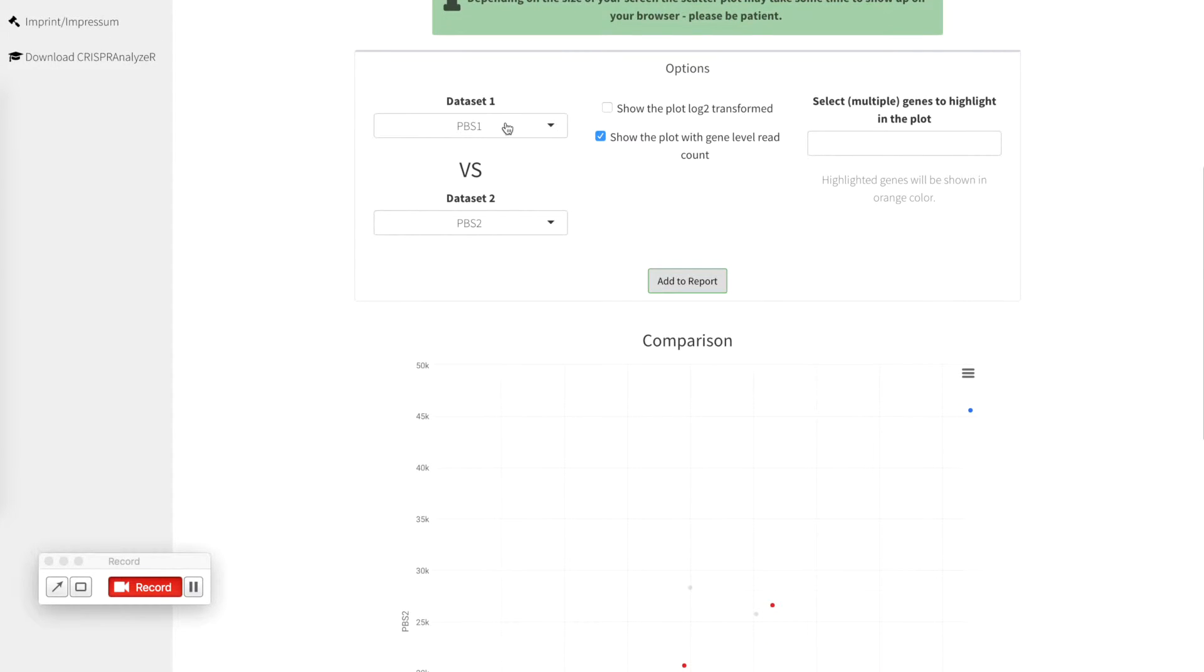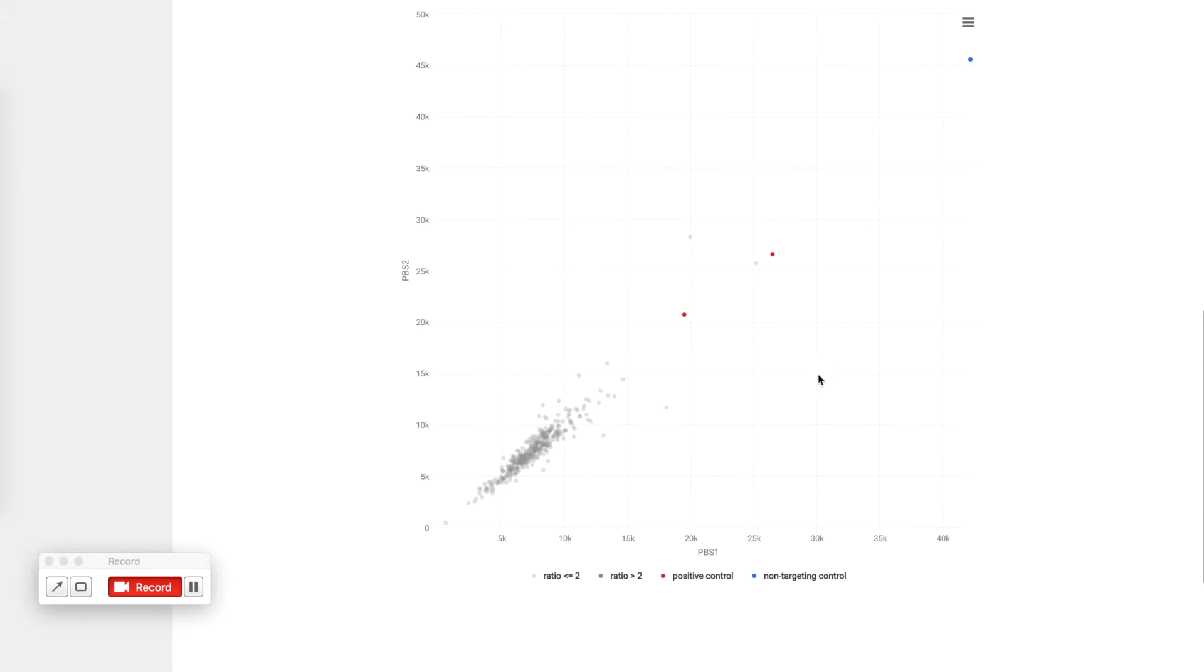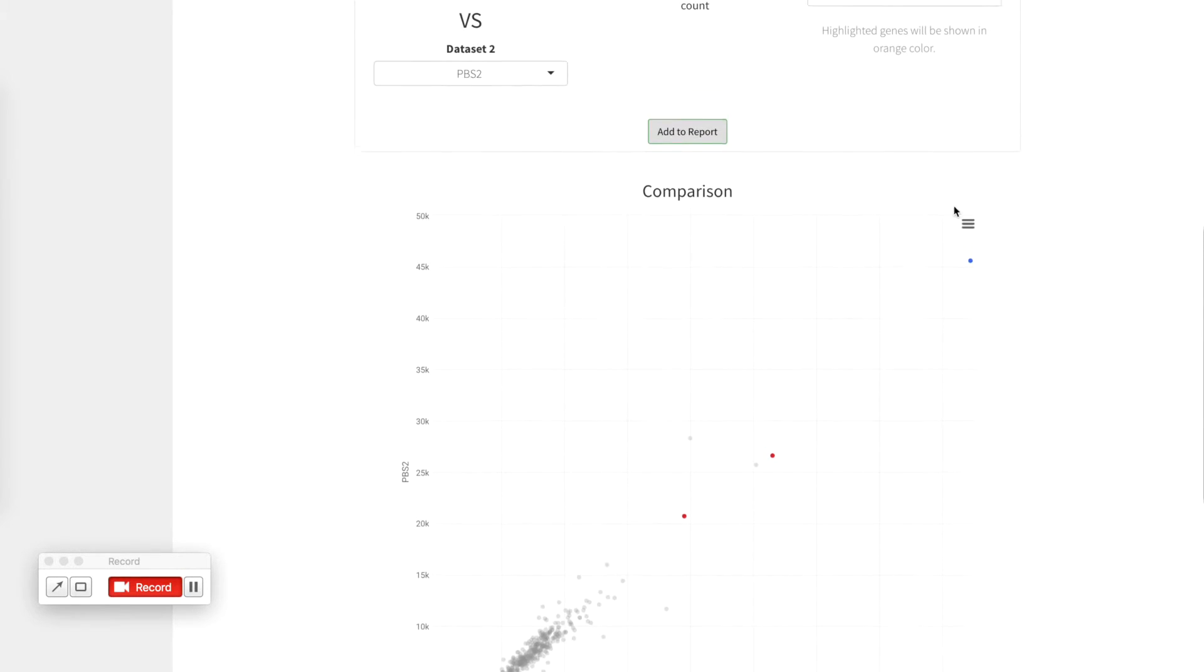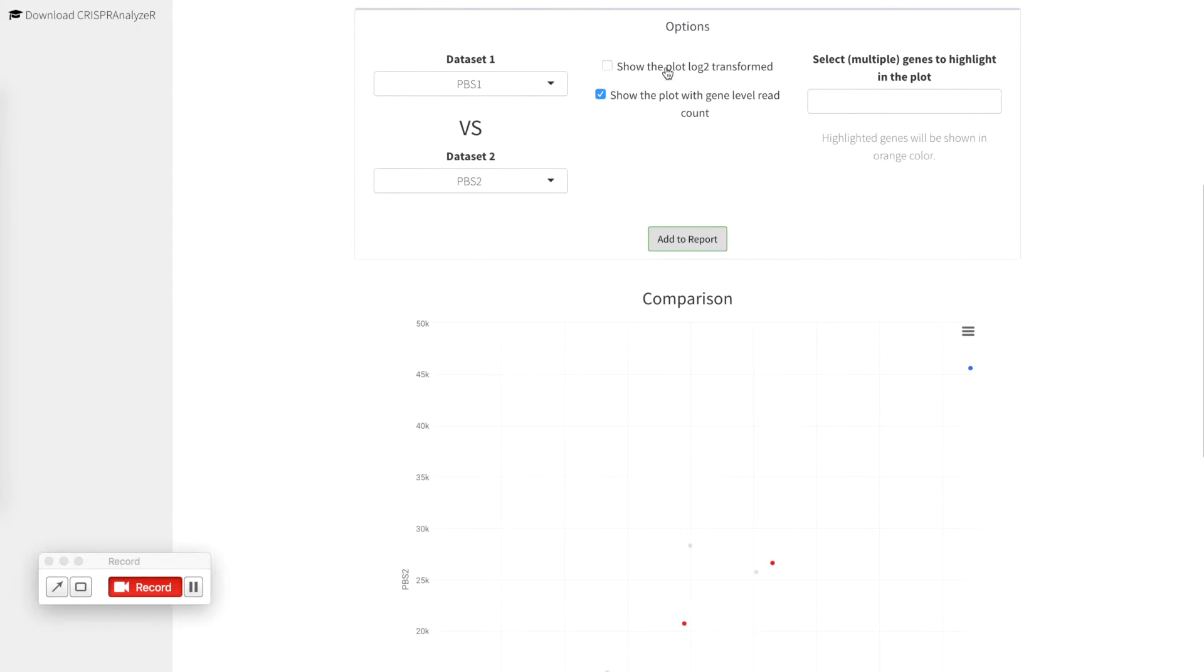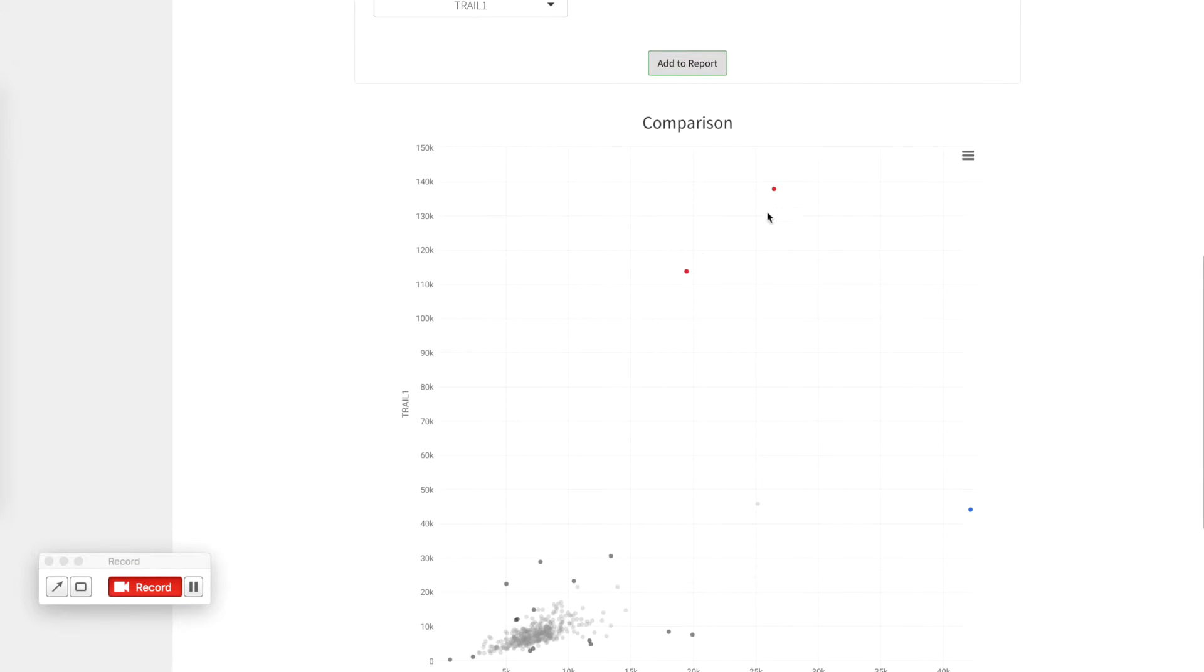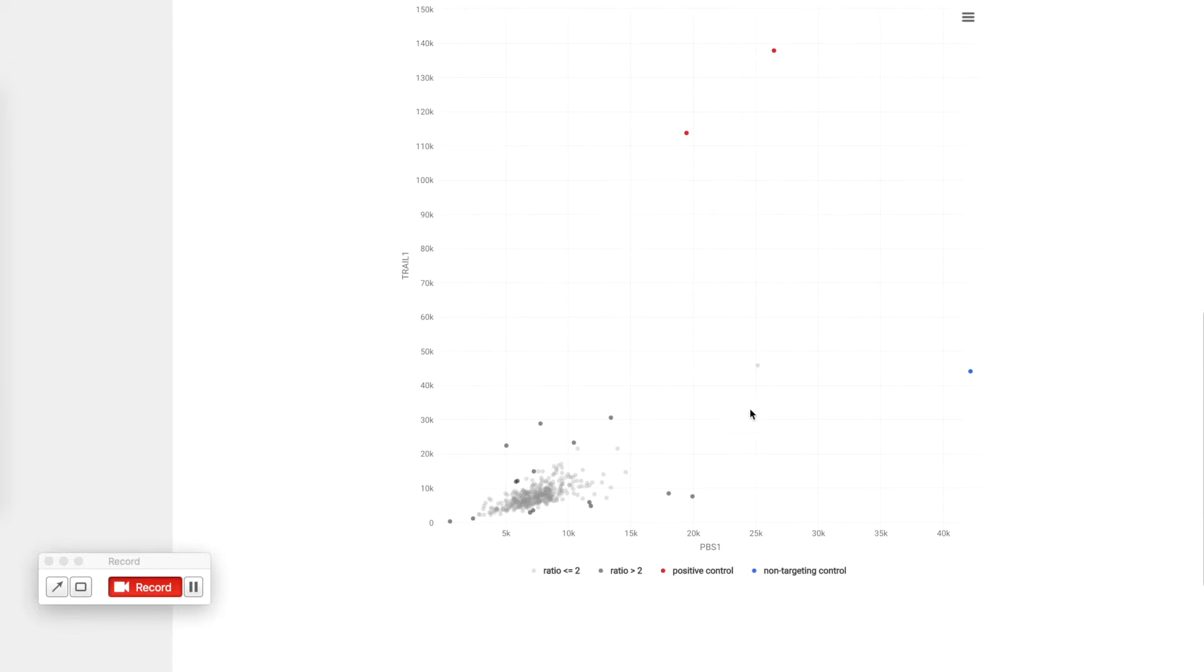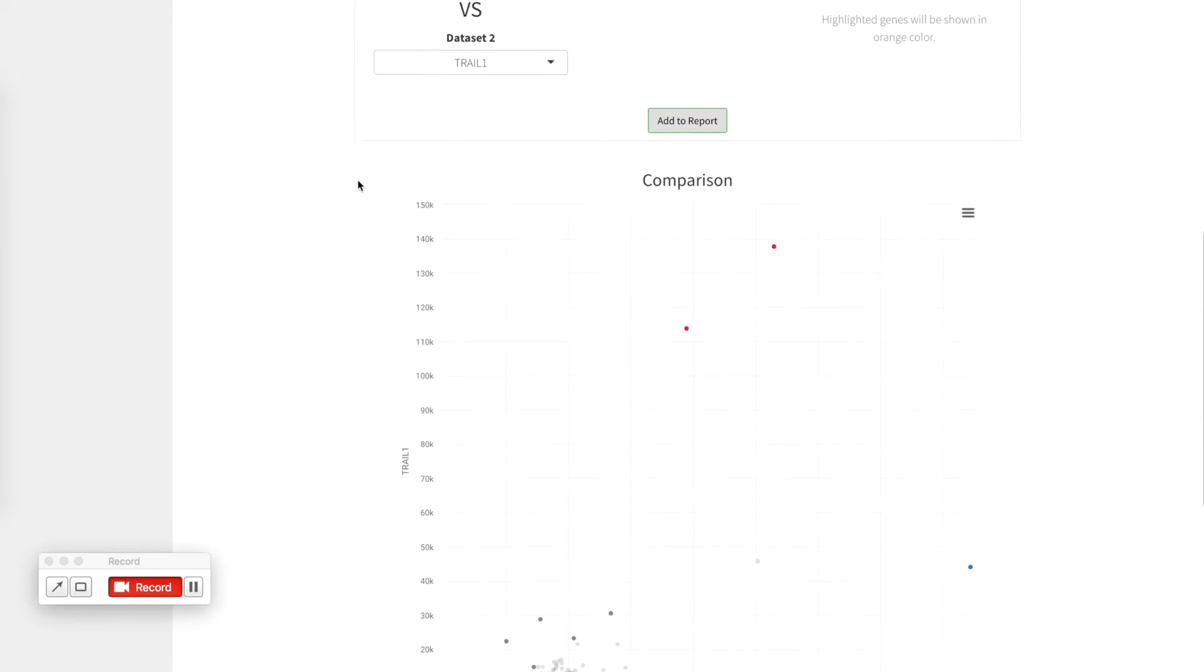So here you can compare different data sets individually, in our case the two PBS treatment groups and you can see that all genes are more or less along the line. You can hover and see the gene information but you can also compare for example one treatment with the other treatment replicates. So now the trail is here and you can clearly see that the two positive controls are highly enriched in your treatment data set.